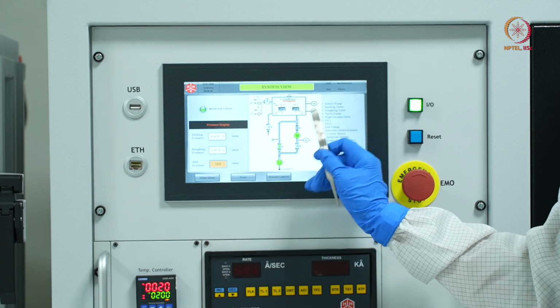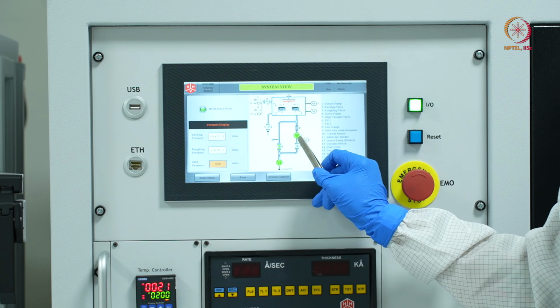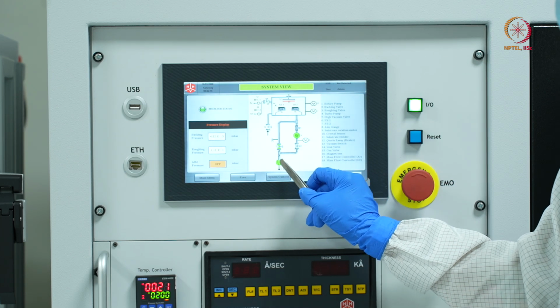When I press start, the turbomolecular pump starts accelerating and reaches its maximum speed, and there is vacuum generation, or evacuation of this line.